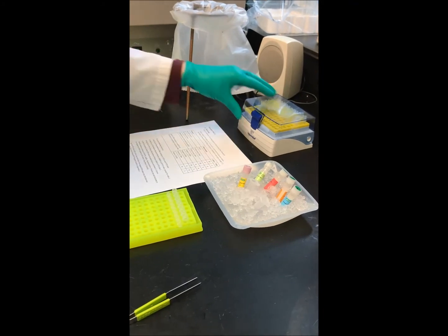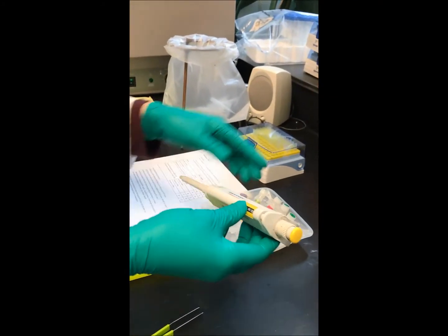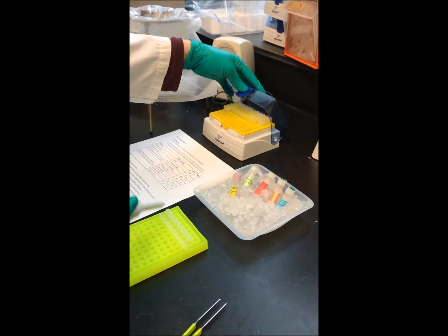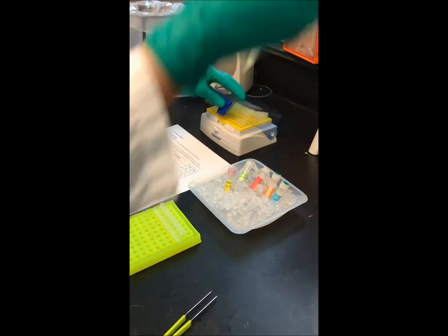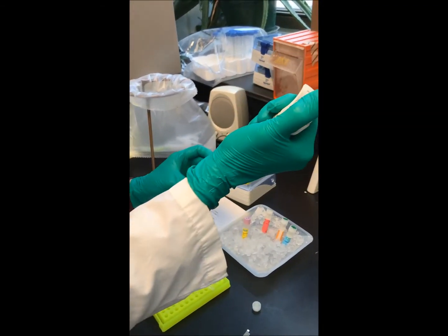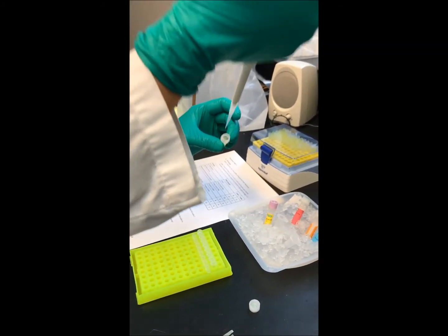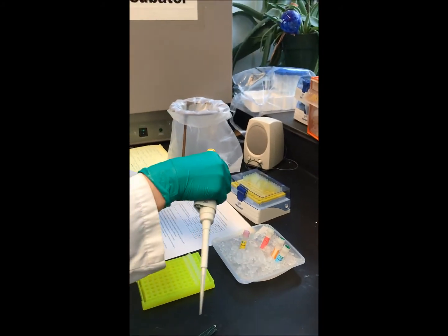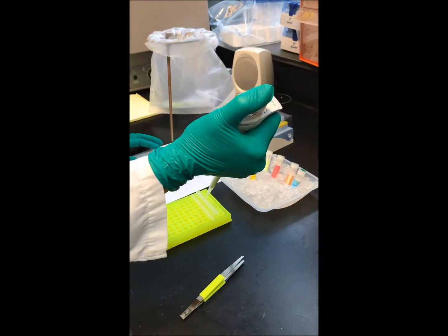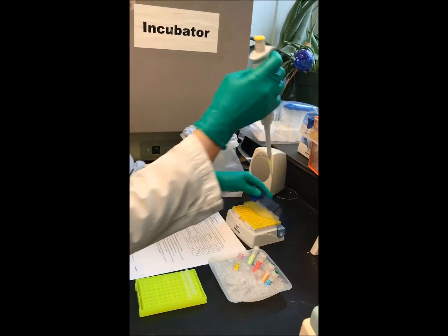And now what we're going to do first thing is we're going to pipette using a pipetter here. We're going to take 20 microliters from each of these DNA samples and dispense them here accordingly in the tubes. I'm going to take DNA from suspect A. So I just press down, take the sample, and the sample is in my pipette tip, and I'm going to dispense it in the tube number 4. I get rid of the pipette tip because I don't want to cross-contaminate.